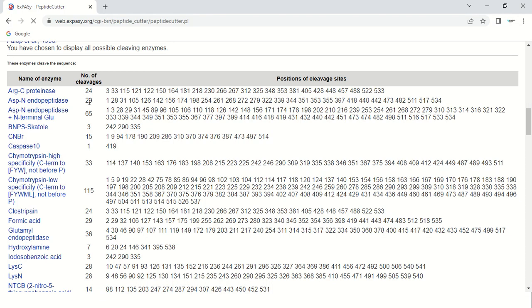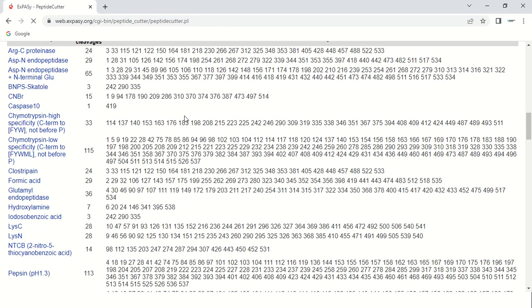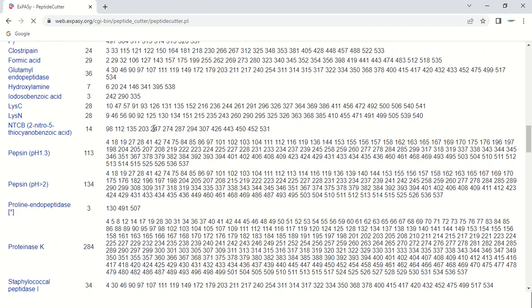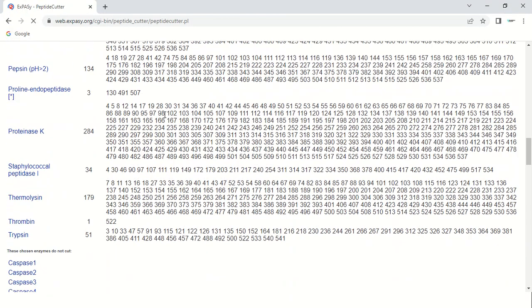Similarly, for Endopeptidase, it has 29 cleavage sites in the sequence and these are the positions of those sites — position 1, 28th, 31st, and so on. Scrolling down further, you can see the data for all the enzymes, because we selected all enzymes, showing which enzyme cuts at which position.